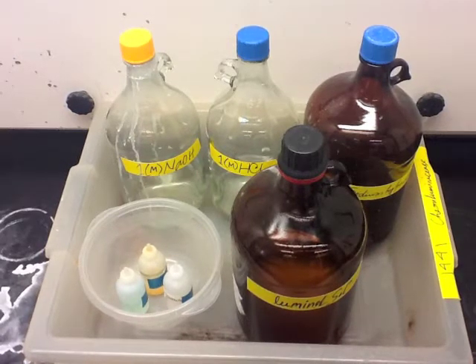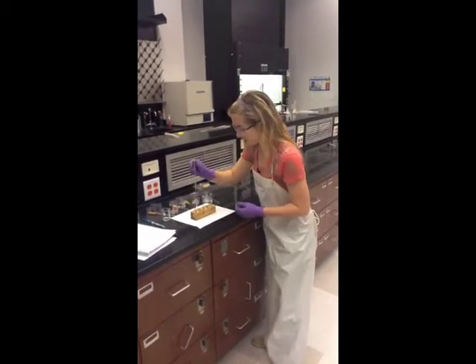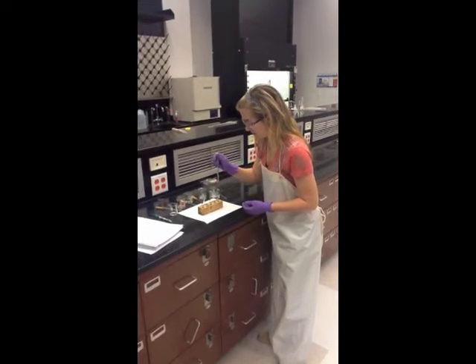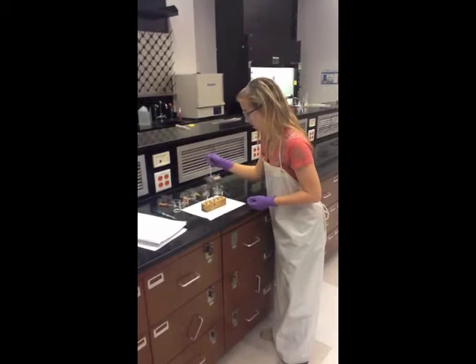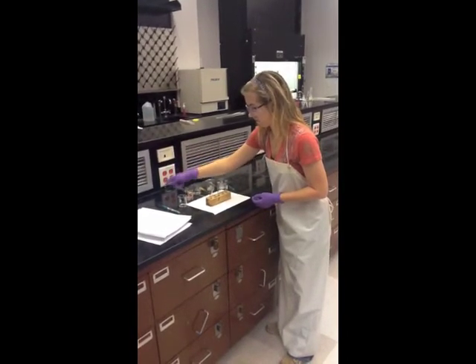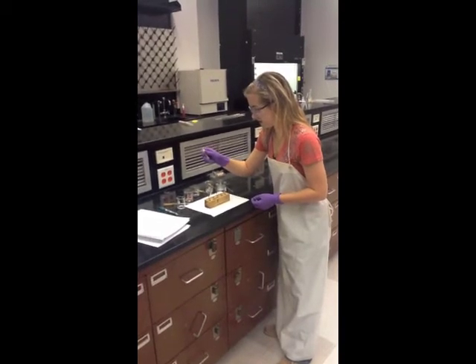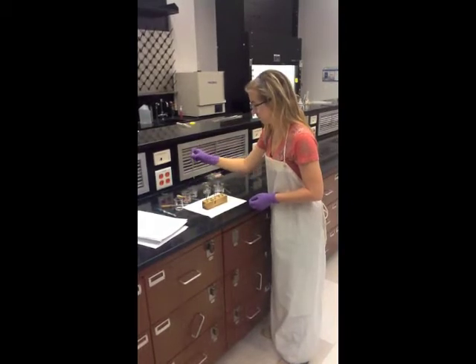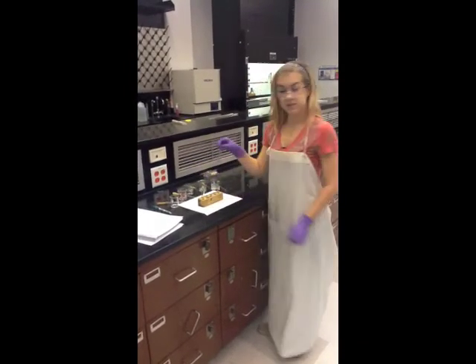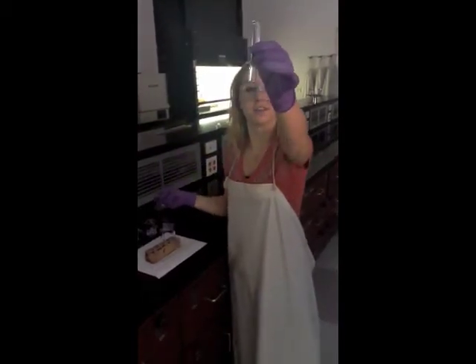Only test one variable at a time, keeping the rest constant. For example, if you are going to test for the optimum pH, use bleach in all three test tubes, keeping the amount constant. Add an acid to one, add a base to one, and water for a control. Once these are all mixed, you are ready to add your Luminol. Add the Luminol by drops. If there is no reaction, try something else.